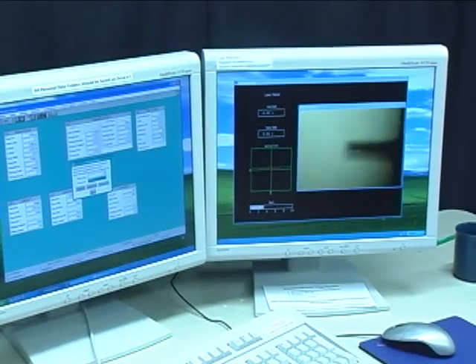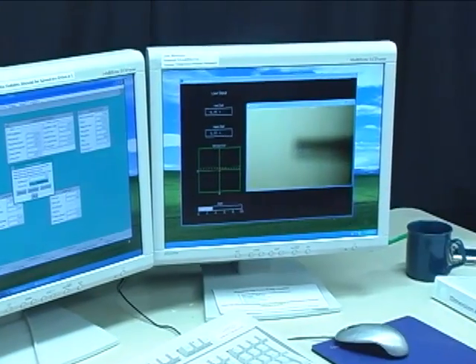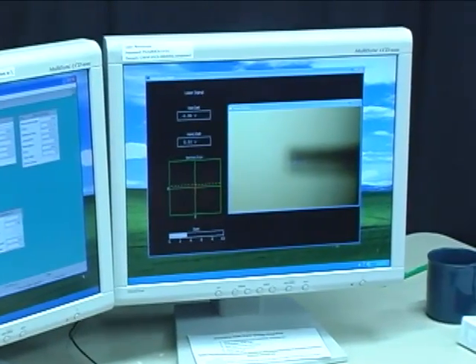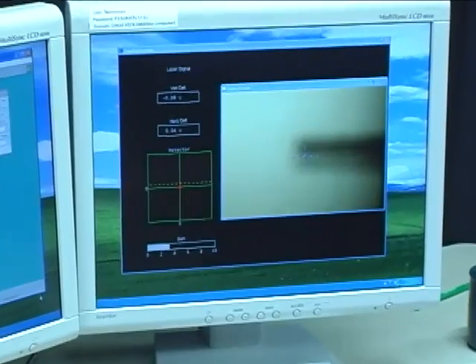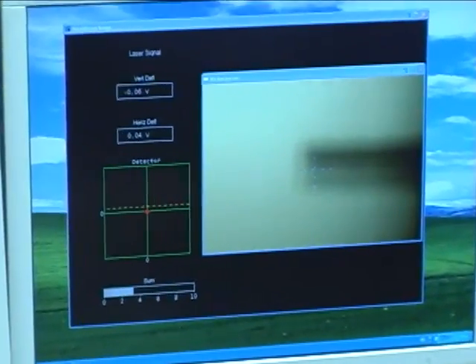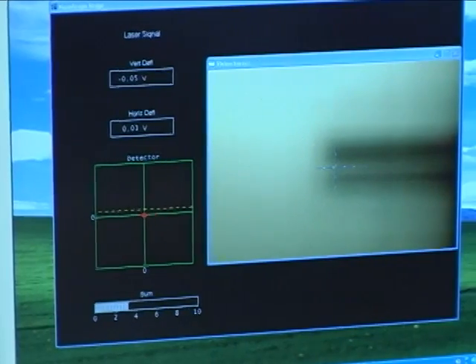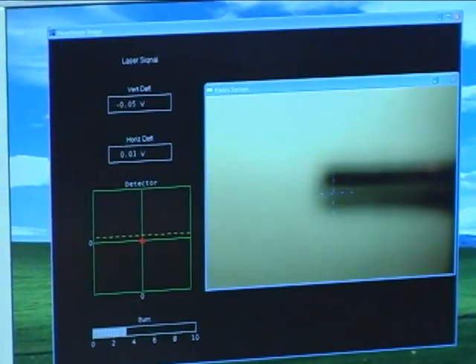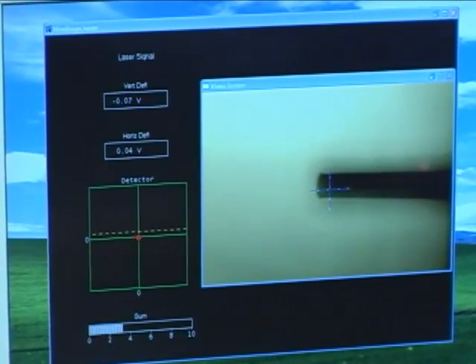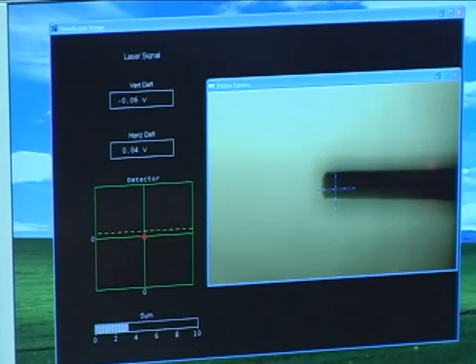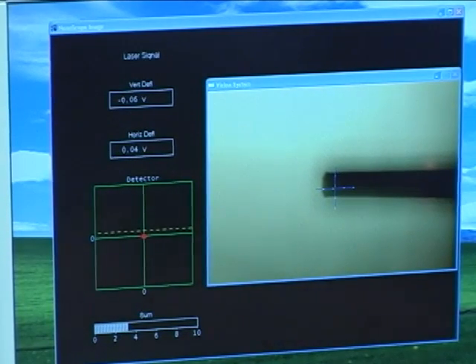We'll zoom in slightly on our tip which is now very blurry. And we'll bring in the microscope head closer to our sample. And we should see the tip reflection come into focus quite nicely like so.